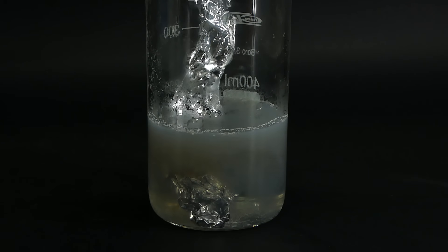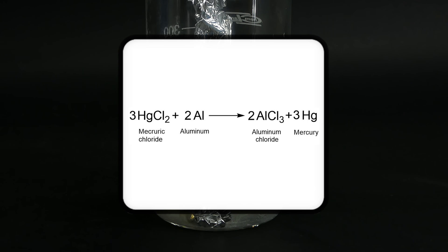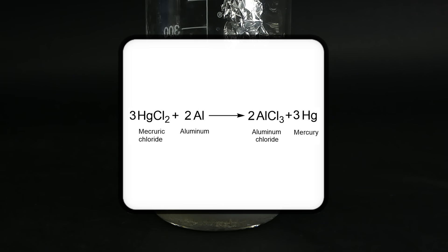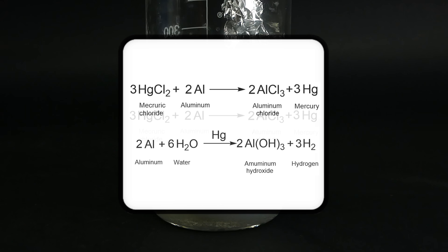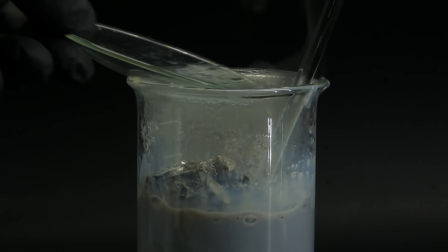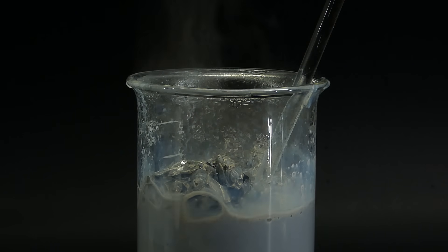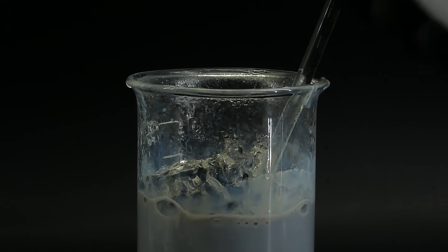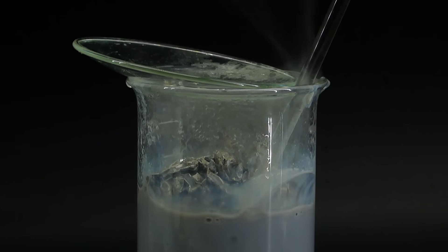The reaction going on here is similar to the previous one. The aluminum, being the more reactive metal, displaces the mercury to form aluminum chloride, but this reaction has a little bit of a twist, because the formed mercury deletes the oxide layer from aluminum by amalgamation, allowing it to react with water to form hydrogen, aluminum hydroxide, and lots of heat. And that is the reason why this reaction is such a mess. The hydrogen produced by the reaction also makes this thing a fire hazard, and together with the fact that there is mercury present, it is like a cherry on top of a cake.